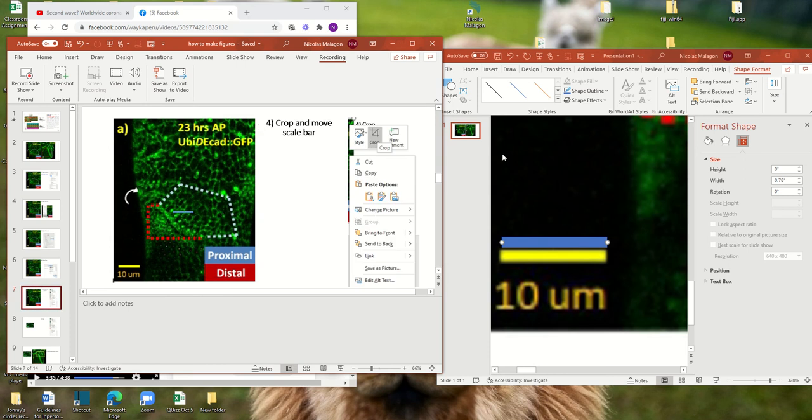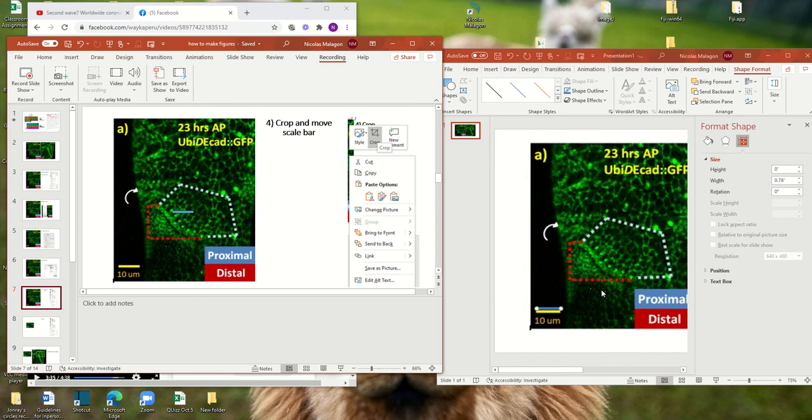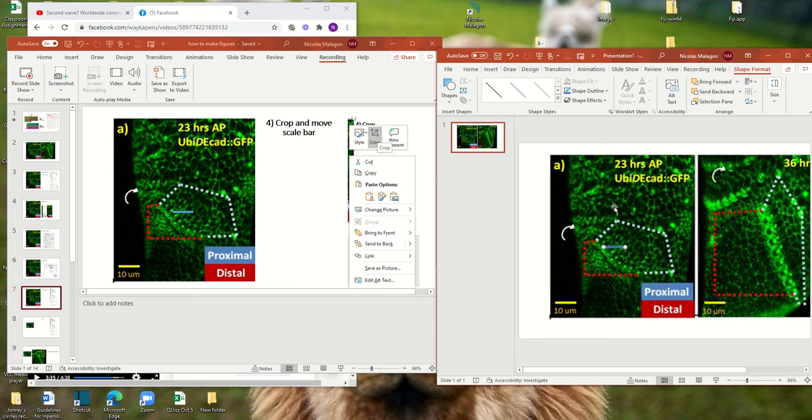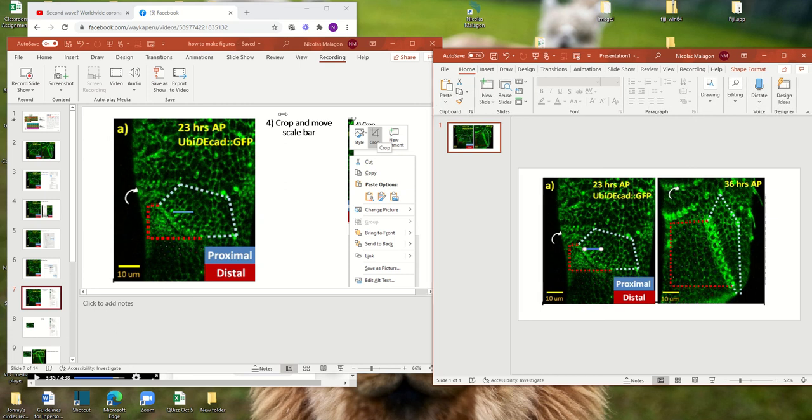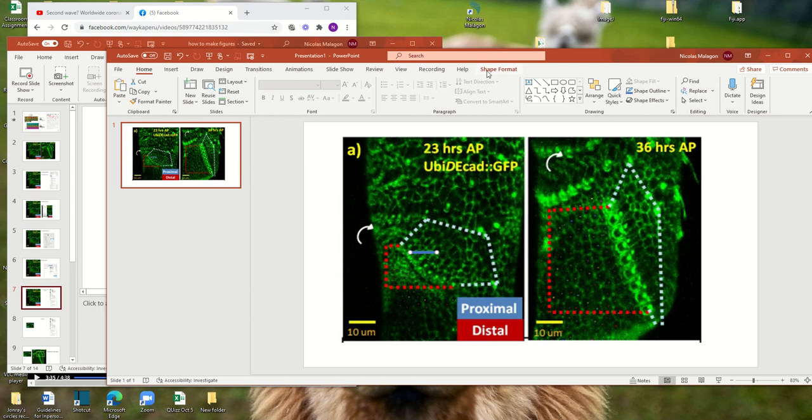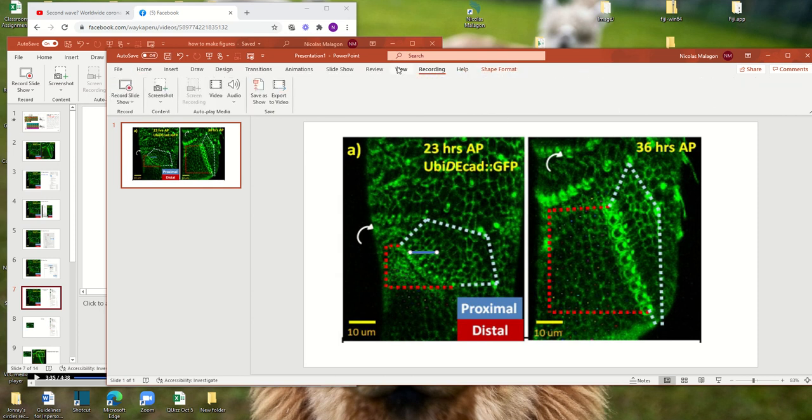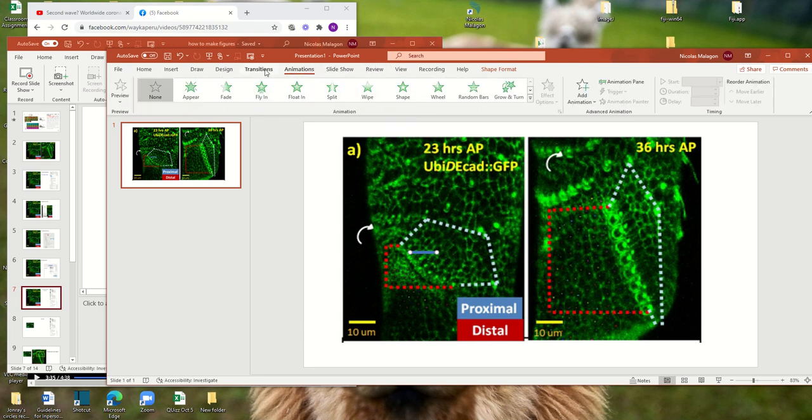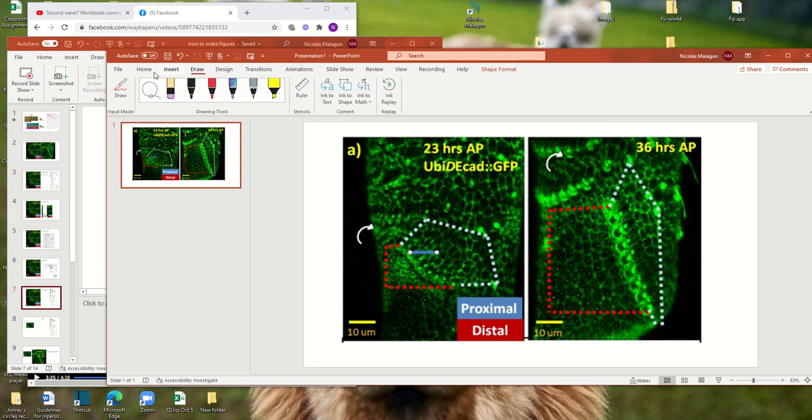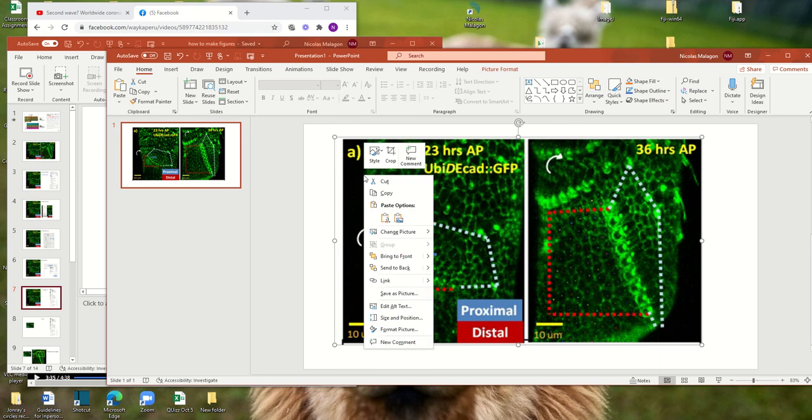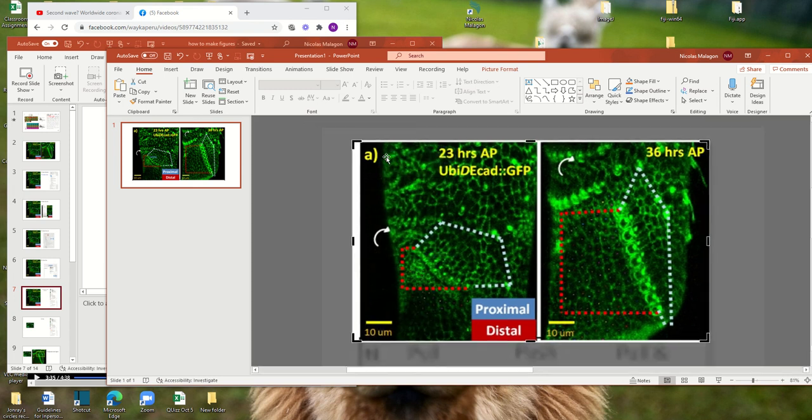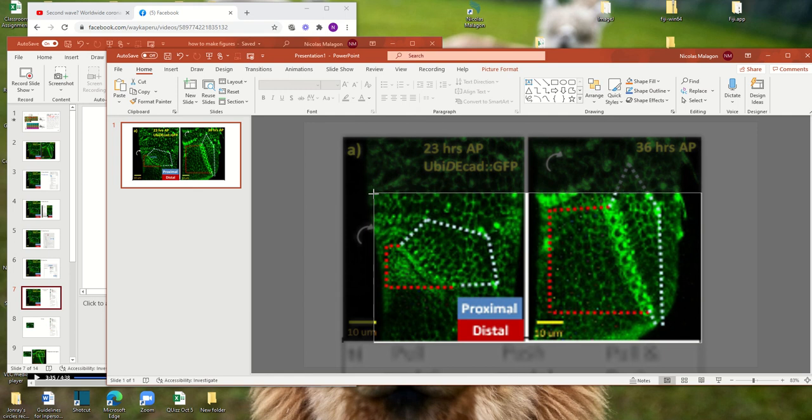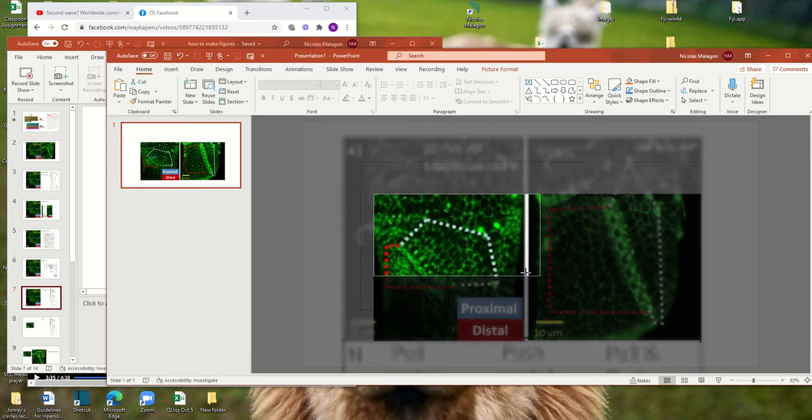Now you can go and crop and move the scale bar. So as we want to focus only in this section, you don't need all the other parts of the graph. What you can do is go home again. So I went left click and here crop is here. You can crop the image.